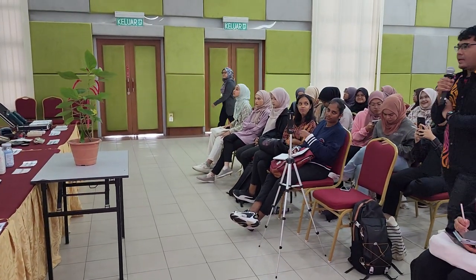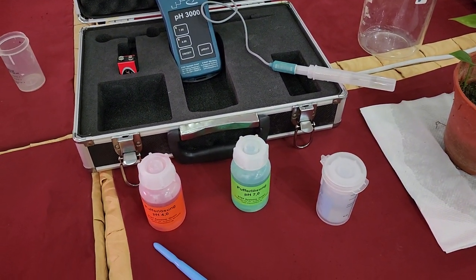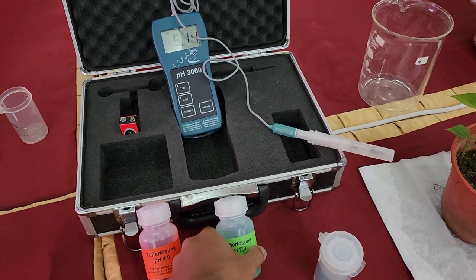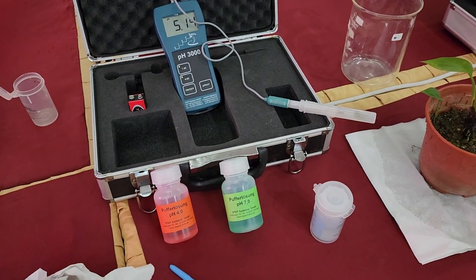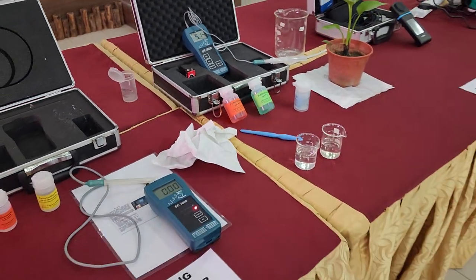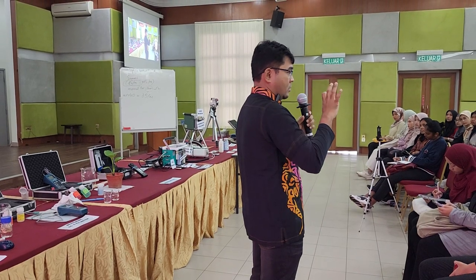So pH, that P actually stands for potential. Potential: how much hydrogen ions are present in the system. Meaning that you can measure hydrogen both in solution and also in soil. This hydrogen will cause the soil or nutrient solution to be acidic. What if the soil or solution becomes more alkaline or more basic? What happened to the hydrogen? Is it a lot or less? So what is more if hydrogen is less? Hydroxide, OH.